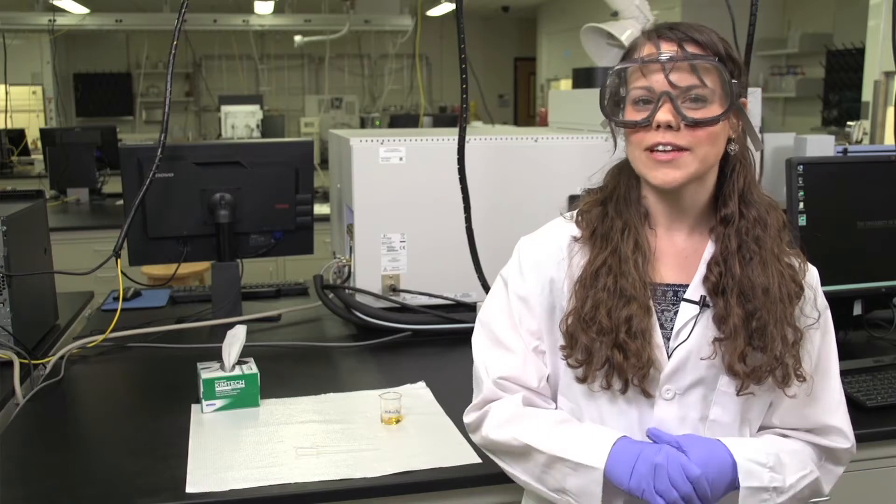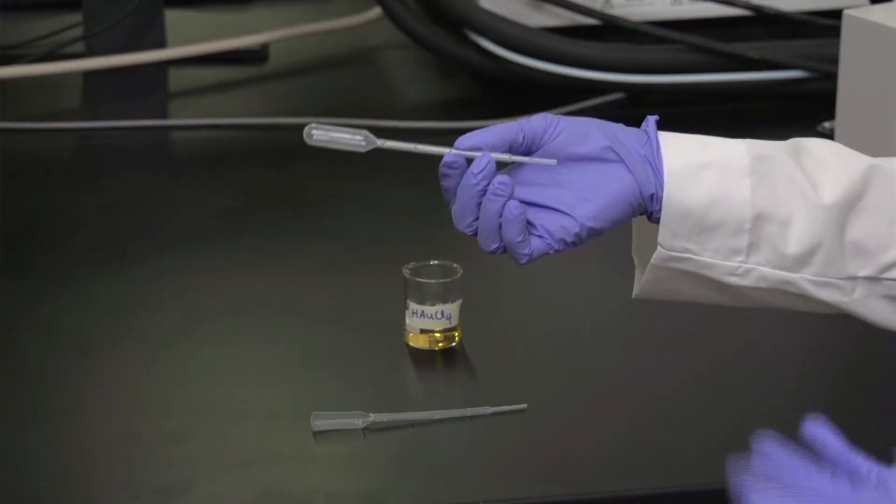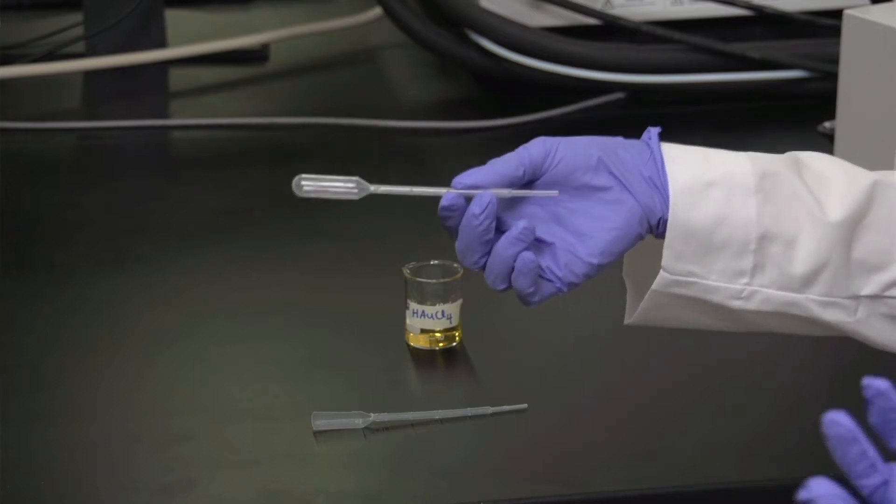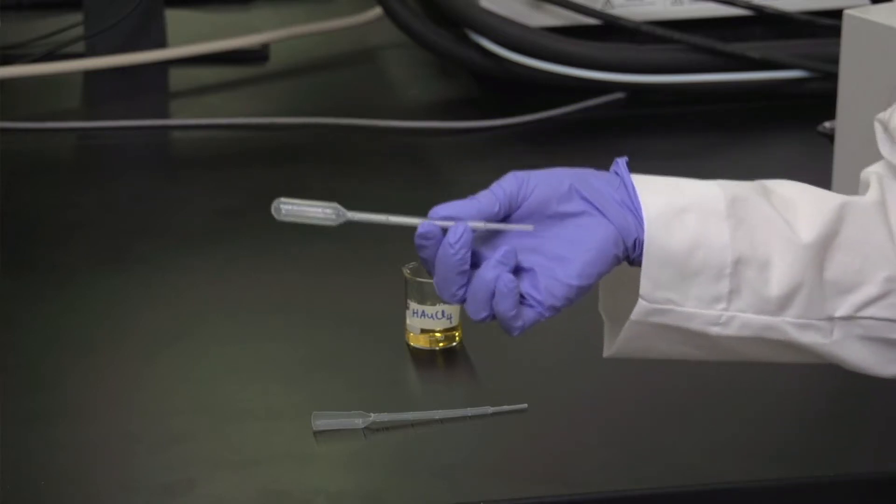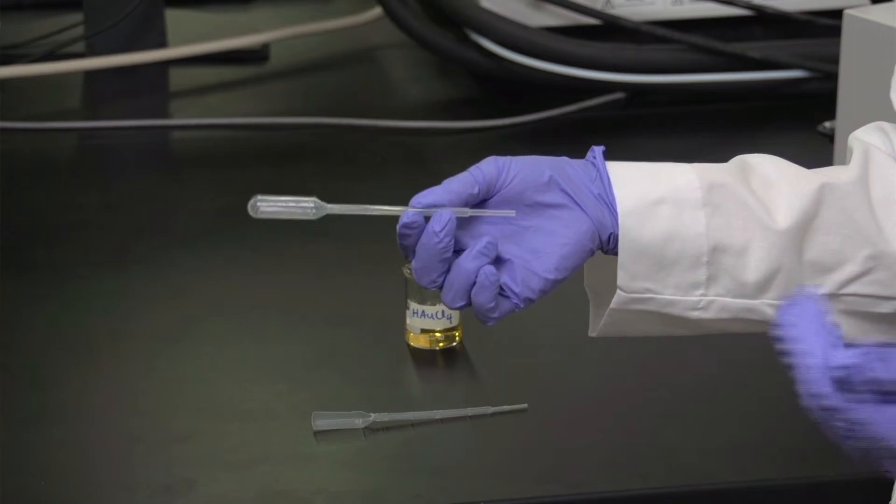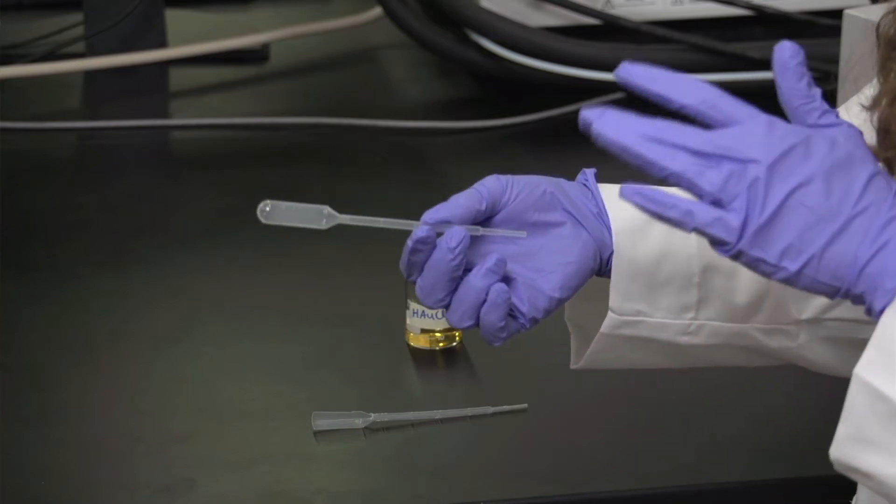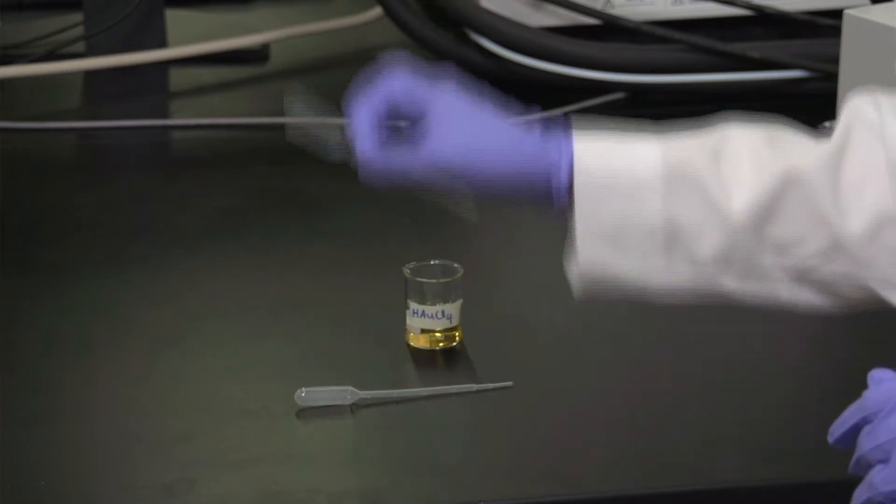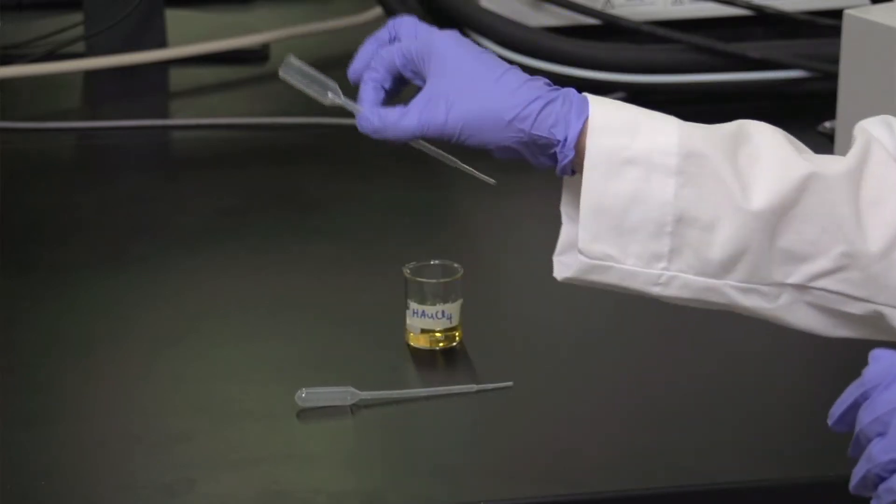So today you're going to be doing the UV-Vis experiment with your synthesized gold nanoparticles. The first step is you're going to need to prepare the chloro-auric acid. Chloro-auric acid is highly corrosive, so you're going to need to use a plastic transfer pipette to measure and weigh out the chloro-auric acid. To do this, you can just cut the plastic pipette into a scoop.